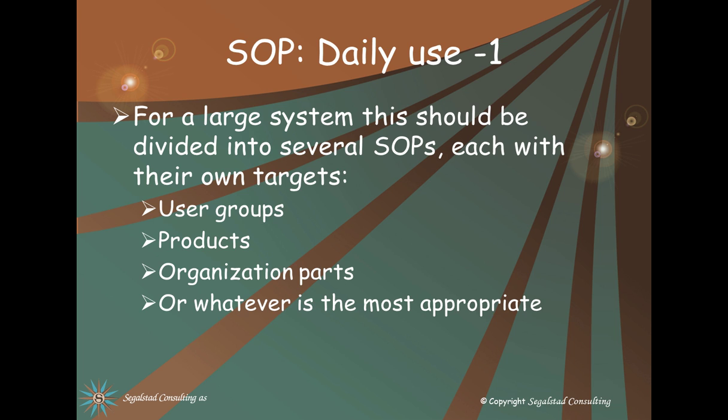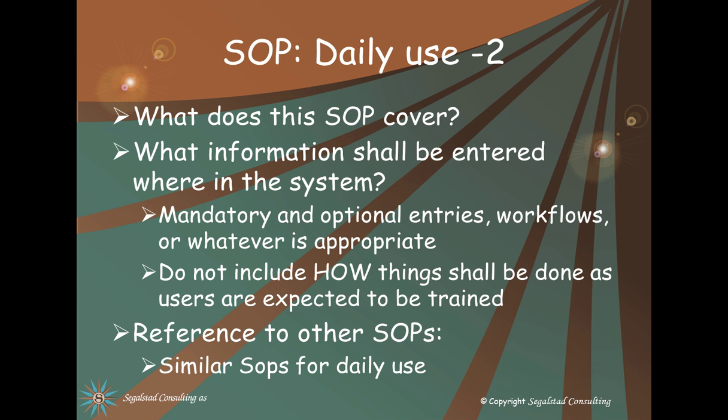We also need SOPs for daily use. For a large system like a LIMS system, this probably should be divided into several SOPs, each with their own targets. And the targets could be user groups, products, labs, organization parts, or whatever is most appropriate in your organization.